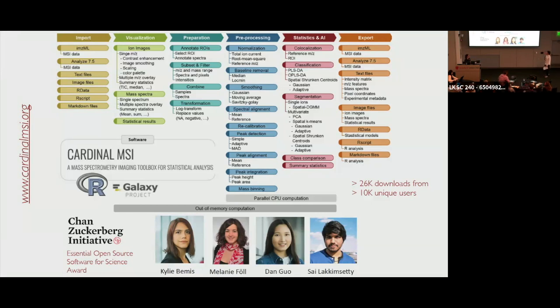Great. I have a question sort of broadly related to this. I think one of the challenges for the non-computational labs is that the software stack is less developed for imaging in general and mass spec imaging in particular than sequencing or other types of bioinformatic approaches. What would be your general advice for the labs that maybe are not familiar coding some of this stuff themselves, for how they can make use of the tools that are changing pretty rapidly?